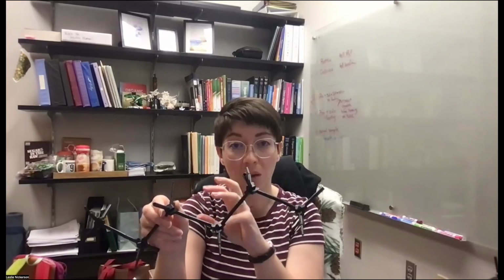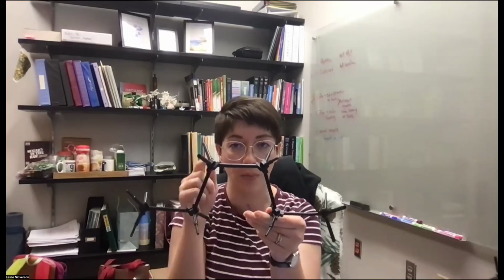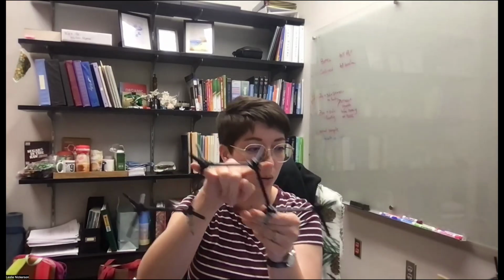But for the rest of the chain, you want to be getting this chain into a more symmetrical, viewable shape to see if there's any other planes of symmetry that we should be looking at in terms of what's reflecting side to side. So same type of process, we're going to do our rotation so that we get more of that U shape. So now we're looking at something that's at least symmetrical with the backbone. And then we can see that we do have a plane of symmetry right here, where that carbon and that carbon are going to be in the same environment, this one and this one in the same environment, and these two in the same environment.